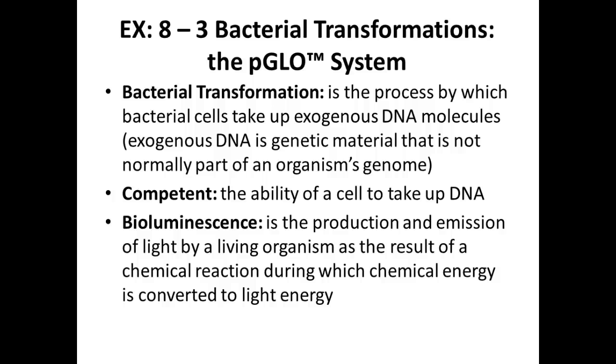So bacterial transformation, what's the definition of this? This is the process by which bacterial cells take up exogenous, so it's coming from the outside, DNA molecules. And they're usually not part of the organism's normal genome. It's genetic information. They have to be competent, and competent just means they have the ability to take up the DNA, right? The cells don't always have this ability. If they're competent, they'll have that ability to take up the DNA.